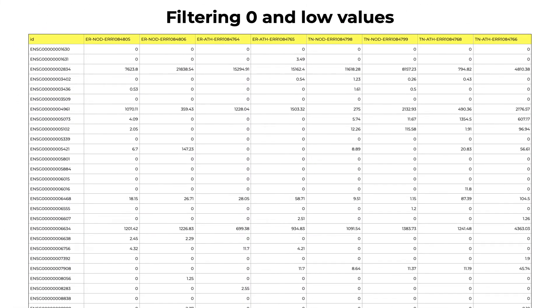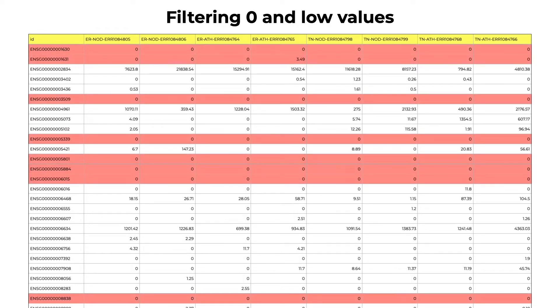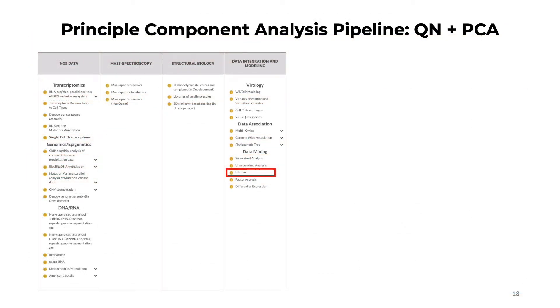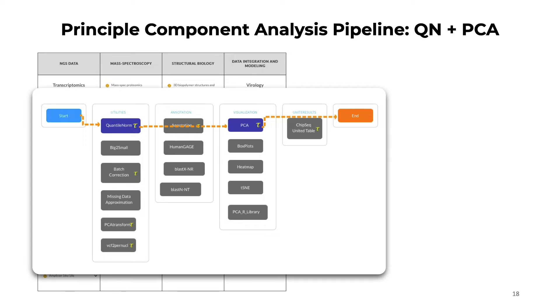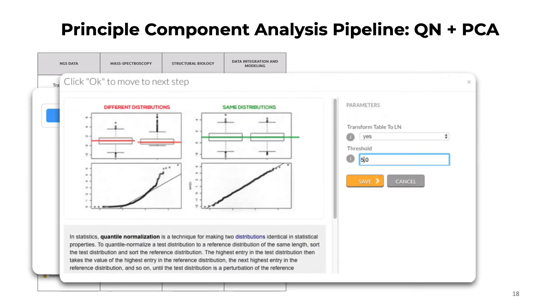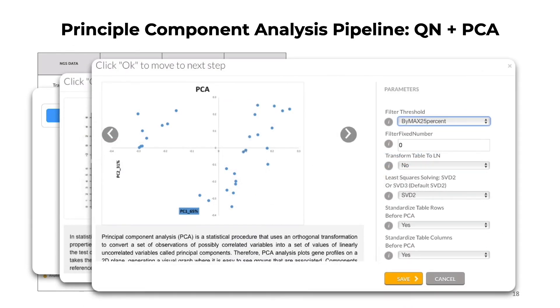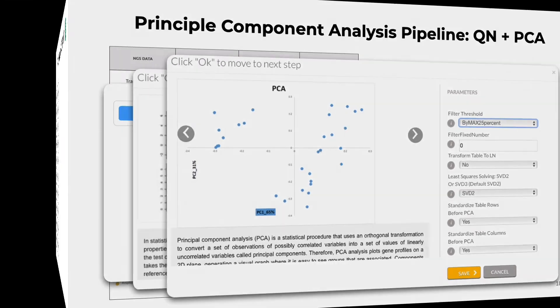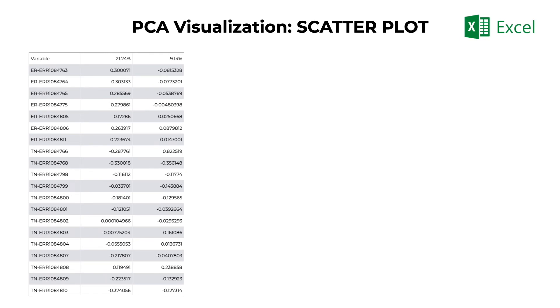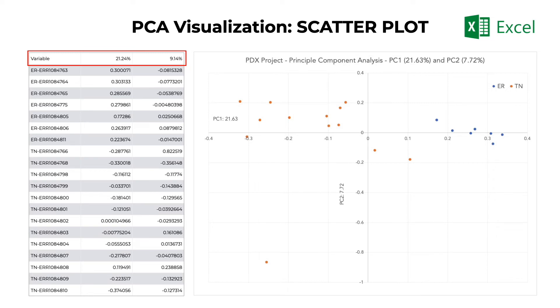So let's now see how to perform such analysis. First, we will take the gene expression table and filter out genes with zero values across all samples and even genes that have a very low level of expression. Next, we'll head to the tBioInfo platform and select the utilities section. Once inside, upload the gene expression table as a tab-delimited txt file. The pipeline we can build will include quantile normalization, where we will transform data to log normal scale and select a threshold of five, as well as PCA, where we can also filter the data using various thresholds. As a result, we will get a table of values for each principal component associated with each sample, with columns containing the percentage of variance that each component explains. We can then visualize our data by assigning coordinates for each sample based on the principal components that best explain the variance.